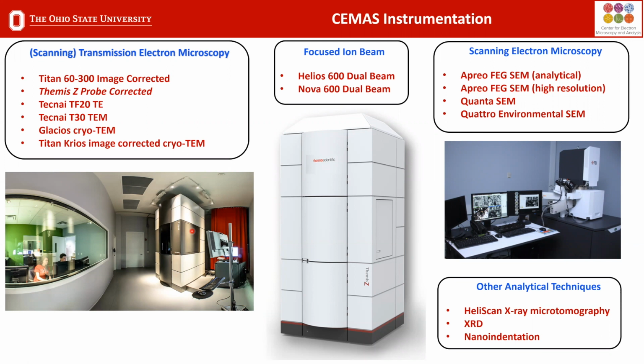And so understanding how to have a good sample is very critical. You can have the best equipment in the world, but if you don't have a good sample, it's impossible to do the things we're talking about. And so I highly encourage you to attend the next Beyond the Scope talk with Dan Huber, who's going to talk about how you make these FIB foils and part of the way that we go about making these good samples to go in these microscopes.